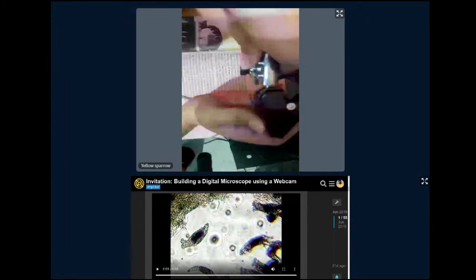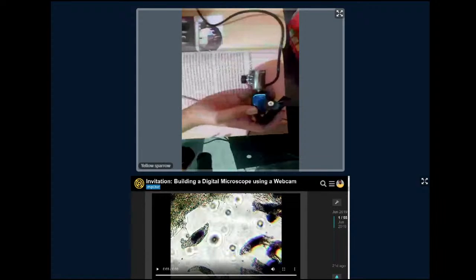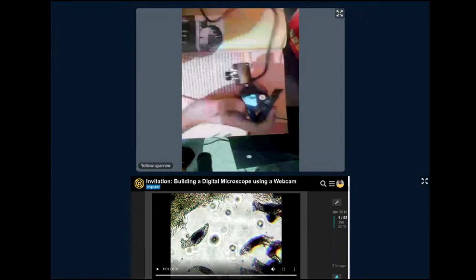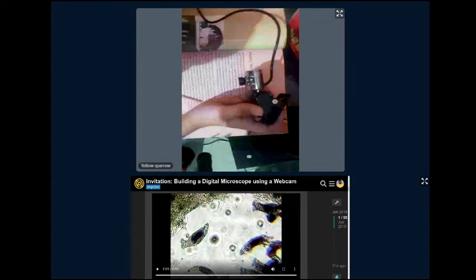What we're showing is the clip. Yes, behind, sir. Here, no, it is a screw. That we don't have to worry about. We don't want that. Place the lens downwards, behind the lens. Put the lens on the book.